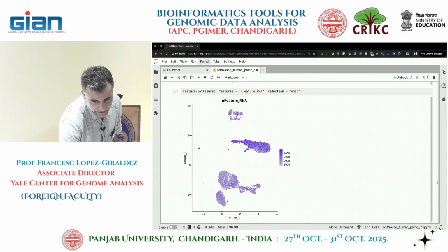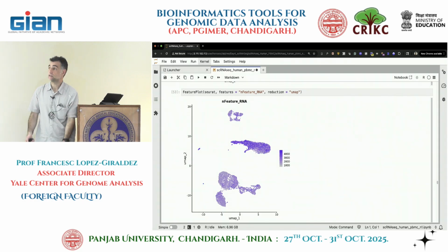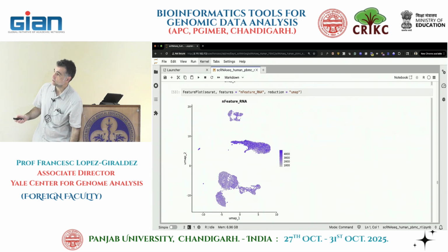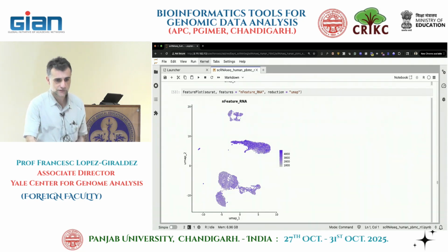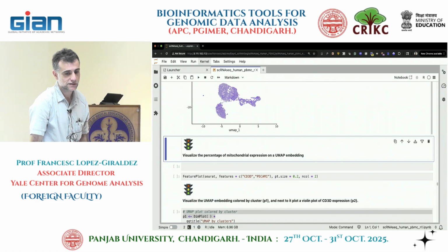There is this other plot that you can overlay information from the metadata table, and ask it, okay, show me the number of genes per cell, right, and give me a scale. So it seems that this group here is the one where we detected more genes. All of them go from 1,000 and up. I don't know. There's probably another group. I don't think this is helpful now, but I'm just showing the capabilities you can have, right? We can also plot, if you want to try, do I have exercises so you can try? Yes. So overlay the mitochondrial expression.